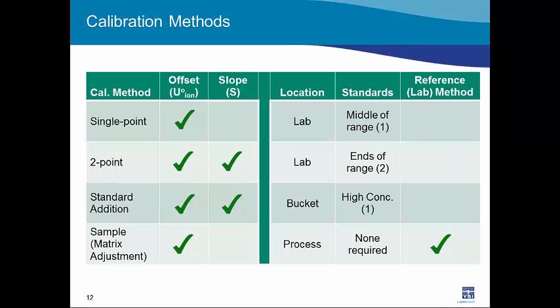Looking at different calibration methods, in general, we list 4 methods right here, starting with single point, which can be used to calibrate the offset.